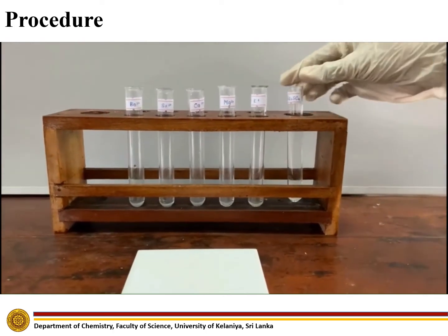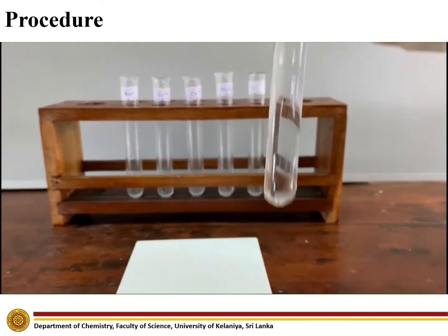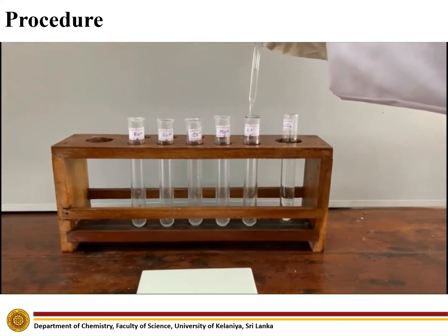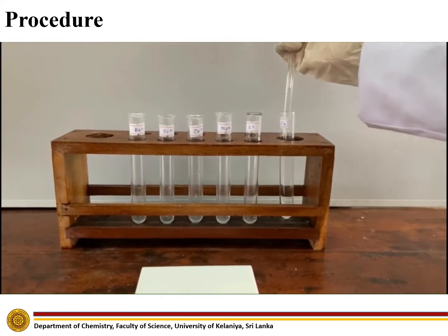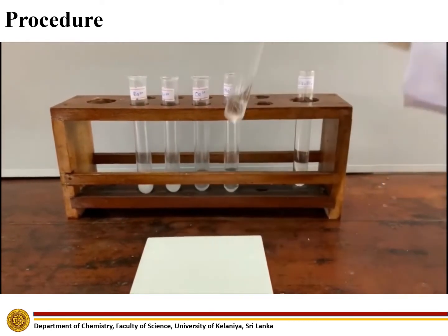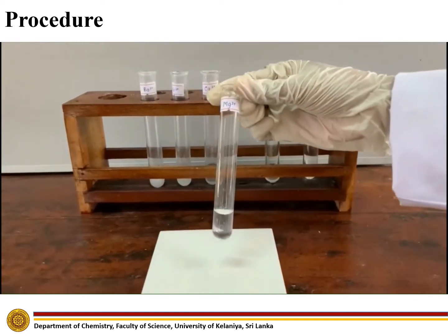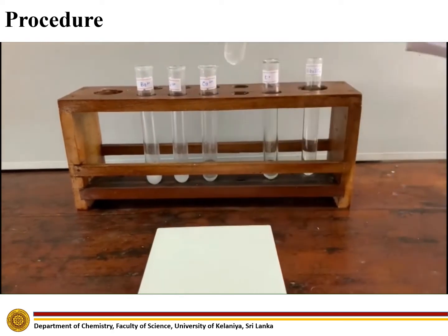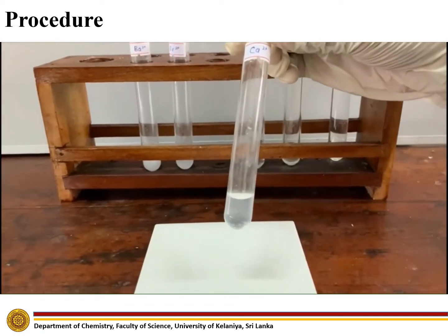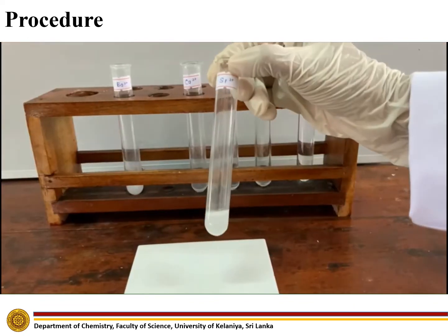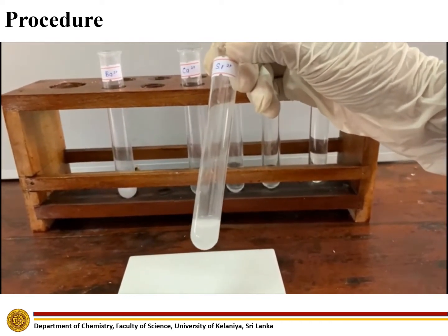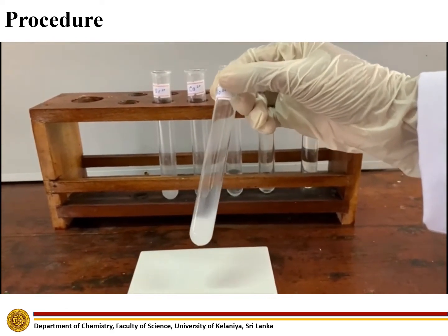Add sodium sulphate dropwise to the given cation solutions. It dissolves well in potassium ion solution and magnesium ion solution. It partially dissolves in calcium ion solution. A white precipitate forms in strontium ion solution and in barium ion solution.